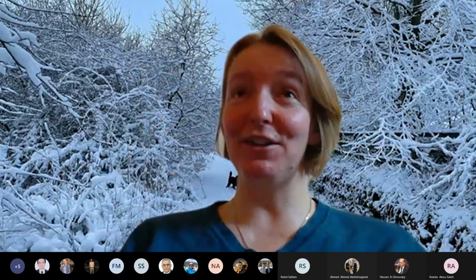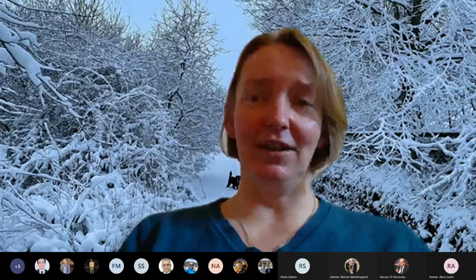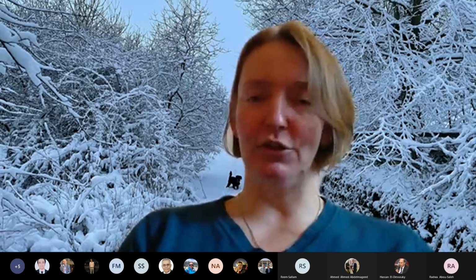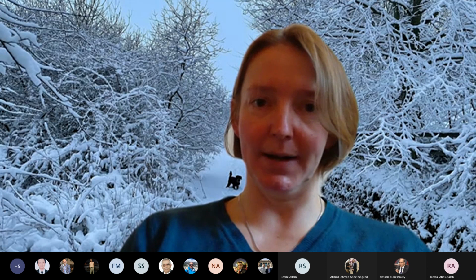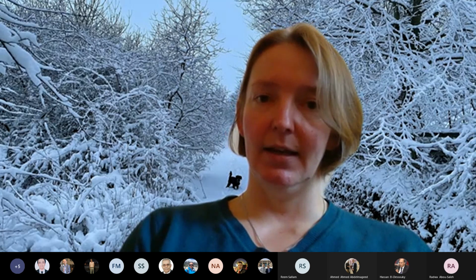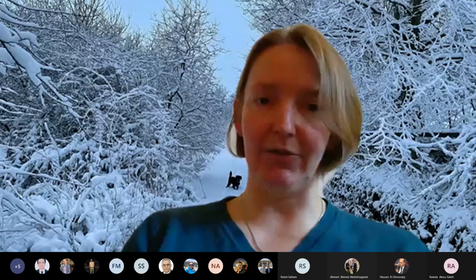In terms of your very good question, and a question I think a lot of cancer biologists are interested in, to give myself a bit of breathing space, I'm not a cancer biologist, but the heterogeneity you talk about is definitely something we see. We don't work with patient samples at the moment because it's still very much fundamental research. We do look at different cells within the same cell line, and even then, from the same cell originally, we see heterogeneity as well.